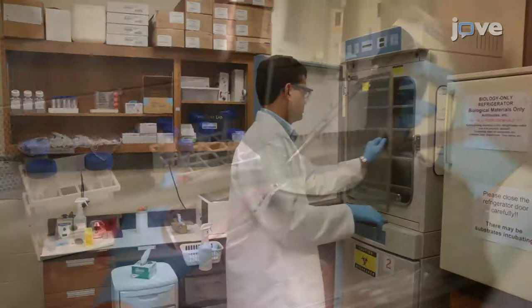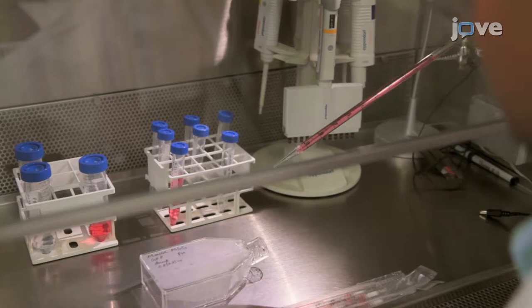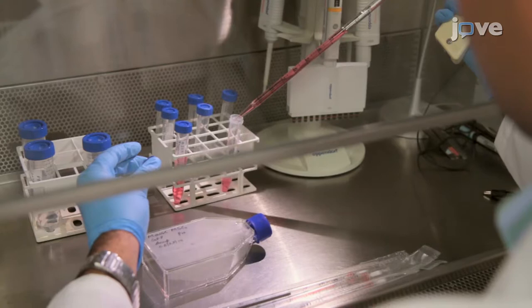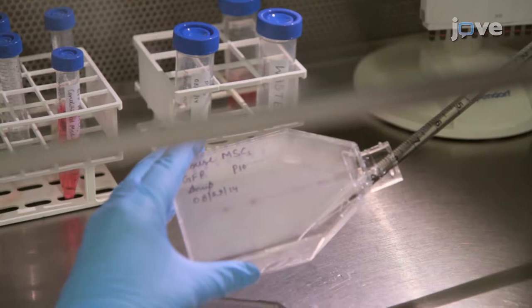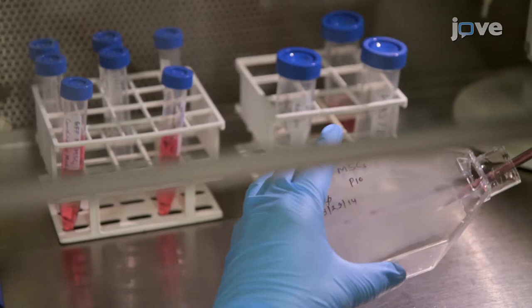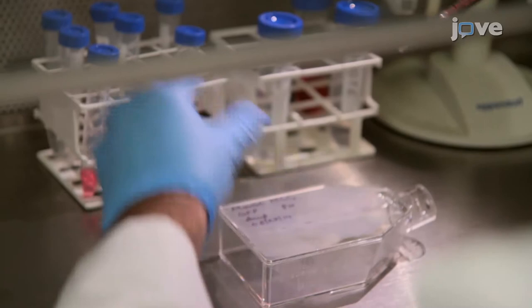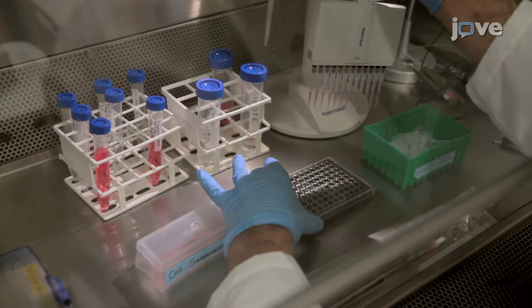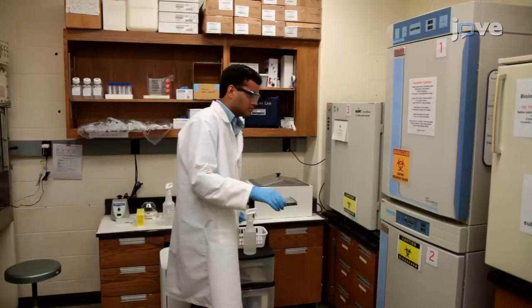In the meantime, under sterile conditions, harvest the MSCs by first collecting the growth medium, now referred to as the conditioned medium, from the flask into a 15-milliliter conical tube. Then add 8 milliliters of sterile PBS to the flask and gently swirl before aspirating the buffer. To detach the cells from the flask, add 1 milliliter of 0.05% trypsin and 0.01% EDTA solution. When the cells have detached, add 8 milliliters of the conditioned medium before collecting the cell suspension and replating the cells at about 300 cells per well according to the text protocol.